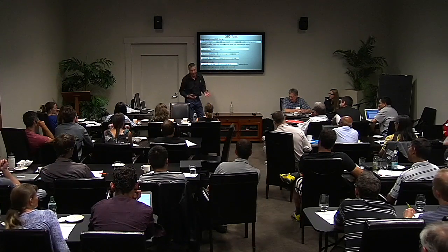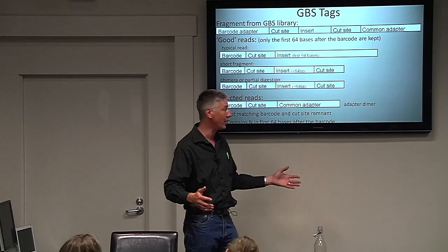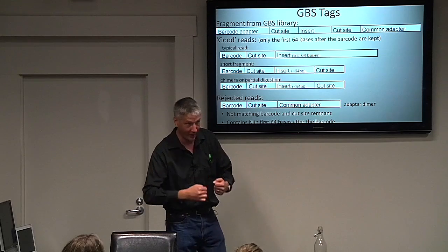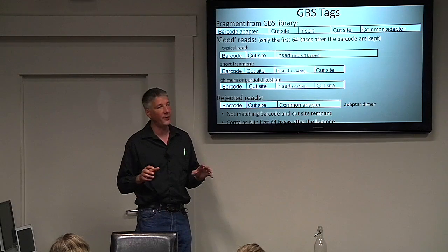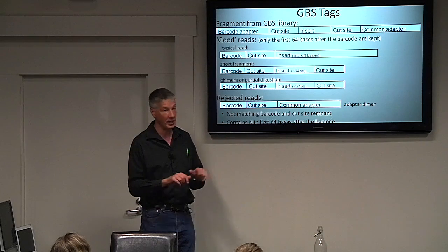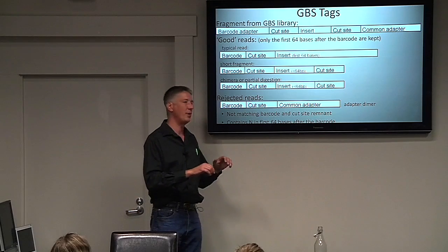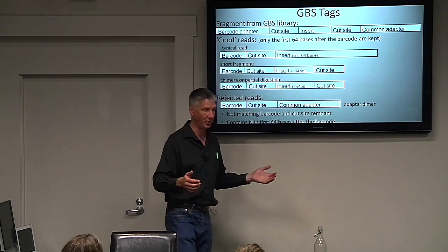It's a great question. I think somebody could probably determine it empirically if they had long enough sequence reads to read through these things all the way and sort it out. But you can imagine that it would happen more often if you had too few adapters, because there would be more opportunity for your genomic DNA to ligate to itself. And it would be less likely to happen if you had enough or excess adapters.